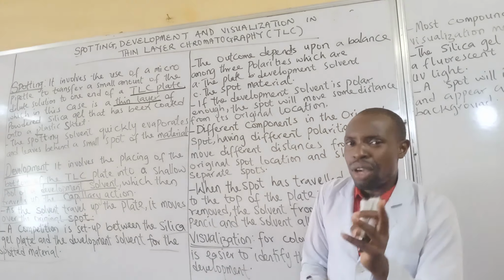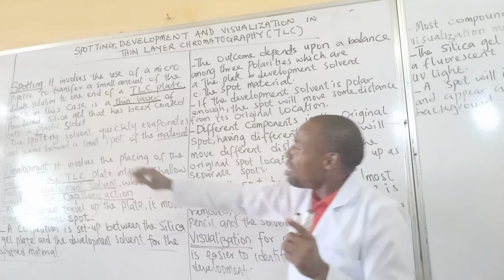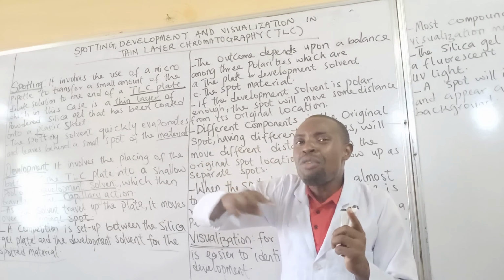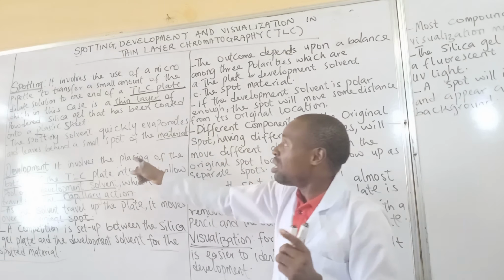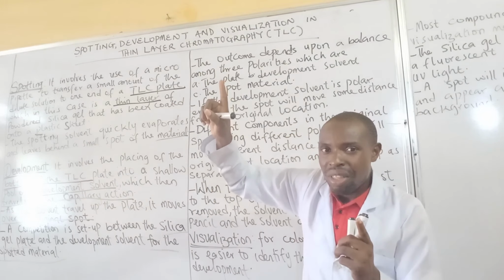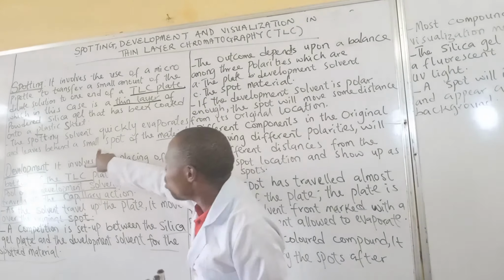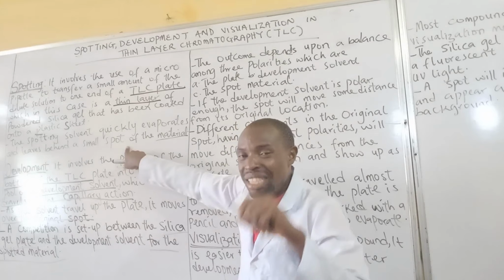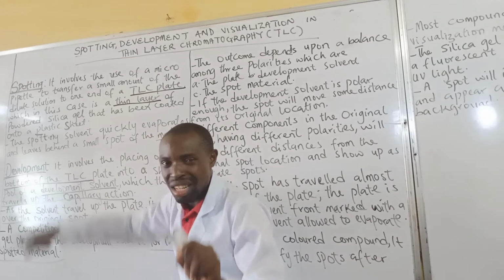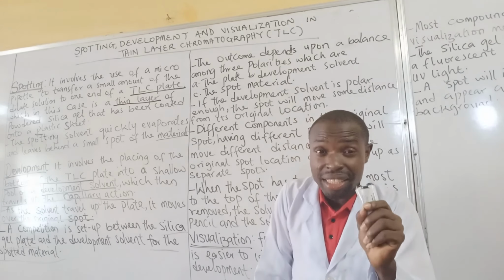Now, please do not forget that as soon as the spotting step is undergone, the spotting solvent quickly evaporates. And if that is done, a small spot of the material is left behind. Take note, a small spot of the material is left behind.